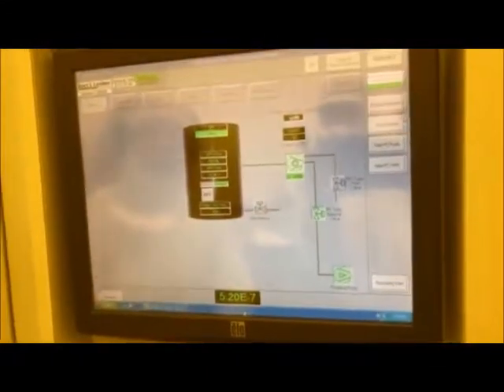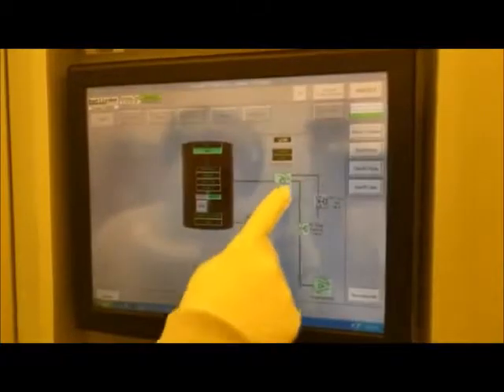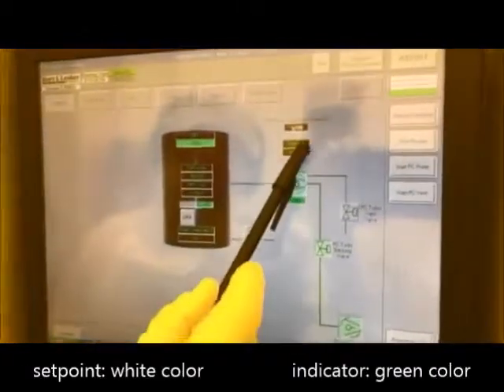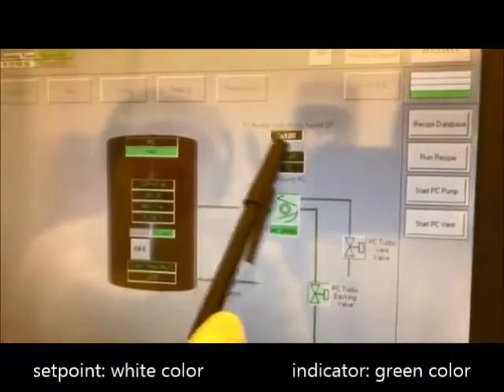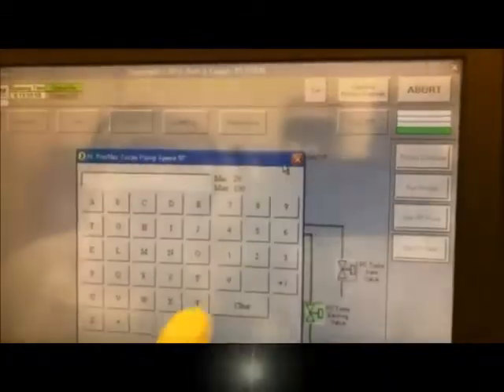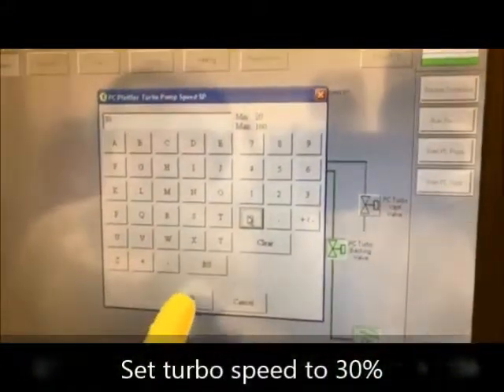So after we write down the base pressure, we are going to set the turbo speed. All the indicators are green. All the white color text is the set point. So I'm going to press this and set it to 30% of the turbo speed. Click OK.